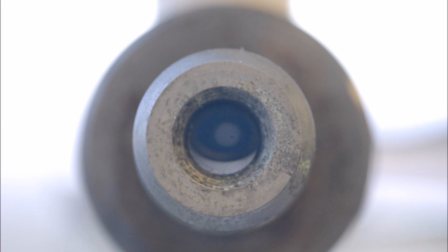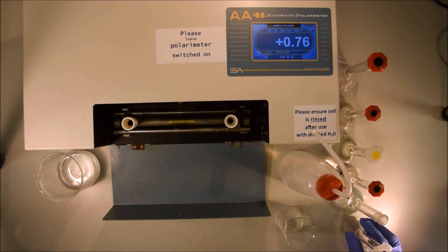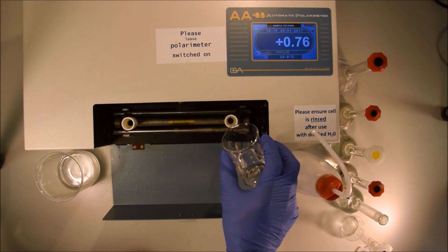The machine will start to say sample too dark and you'll have a bubble and it'll look something like that, and you won't be able to see the light coming through so the machine won't be able to make an accurate reading. If you have that, all you have to do is rock the cell gently from left to right, back and forth a few times until you see the bubble come out.